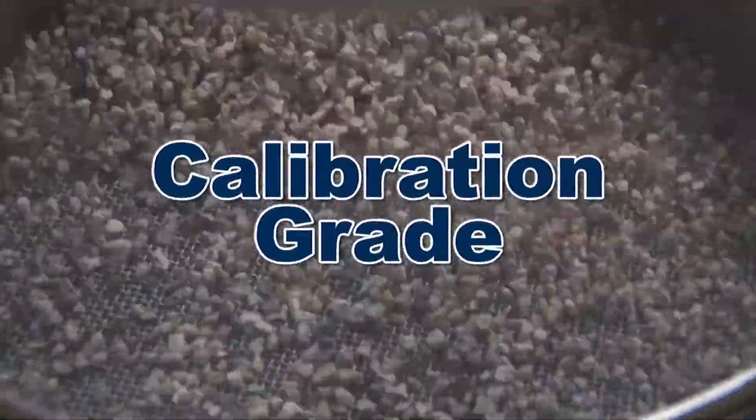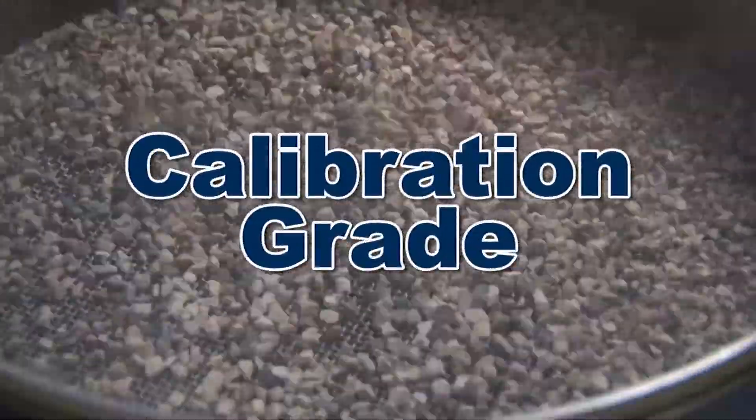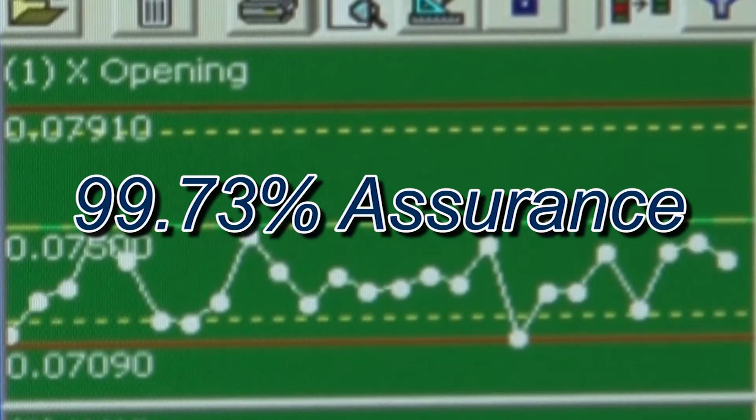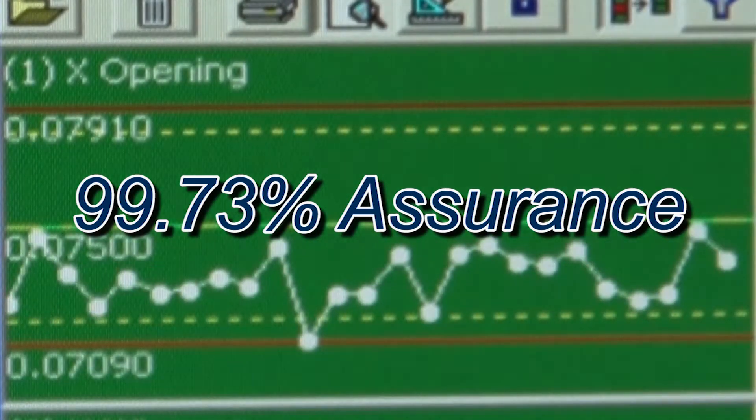And calibration-grade reverification has two to three times more measured openings, with a 99.73% assurance that your test sieve or screen tray meets ASTM or ISO standards.